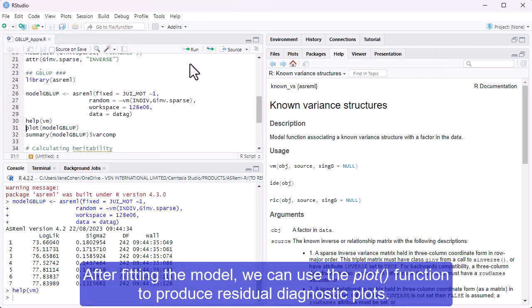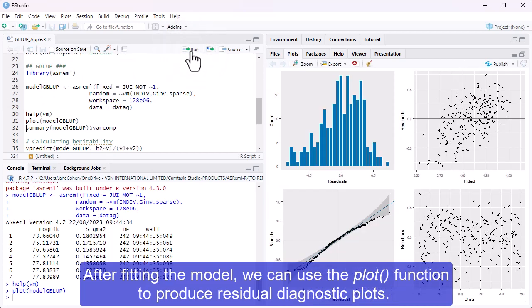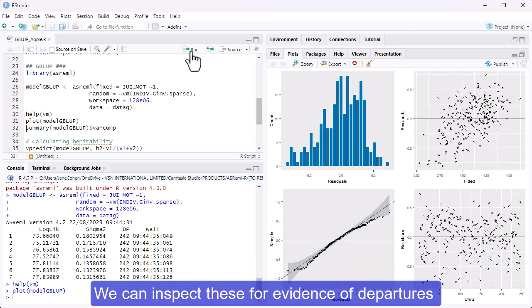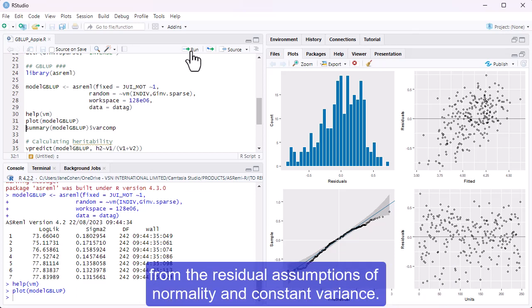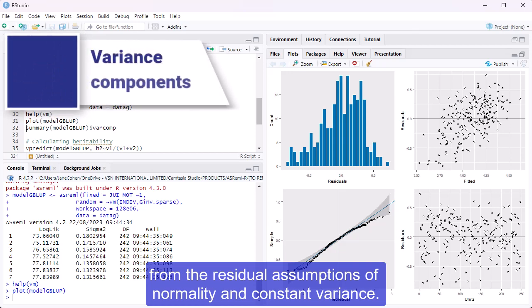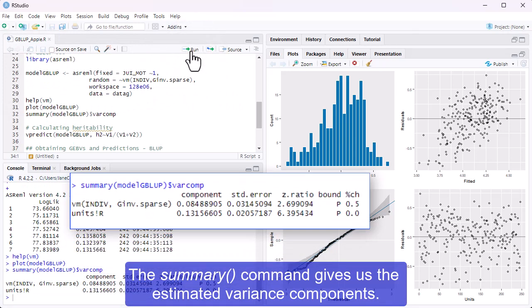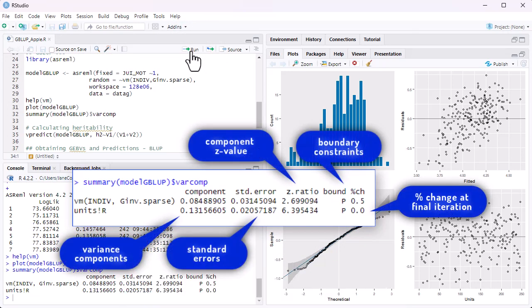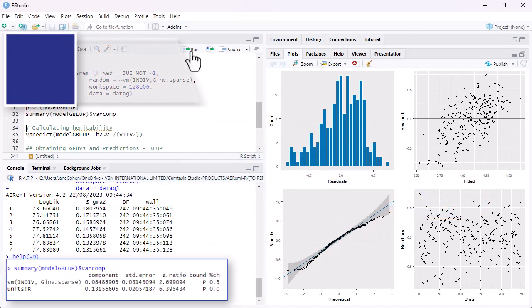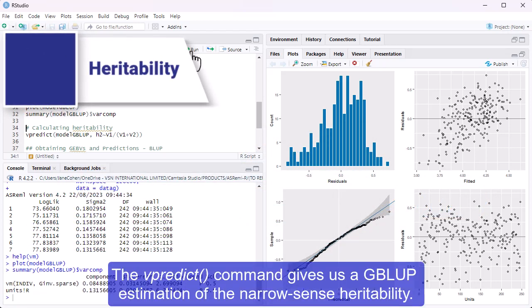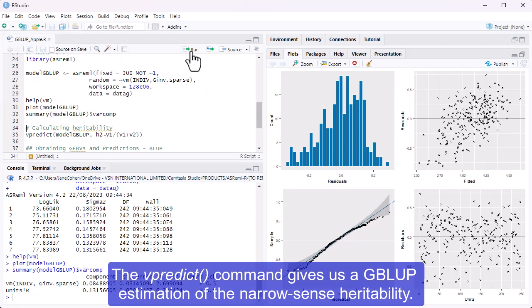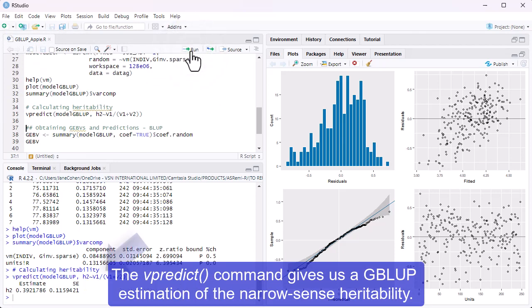After fitting the model, we can use the plot function to produce residual diagnostic plots. We can inspect these for evidence of departures from the residual assumptions of normality and constant variance. The summary command gives us the estimated variance components. The vpredict command gives us a GBLUP estimation of the narrow-sense heritability. Note that this heritability is the one based on the clonal means.